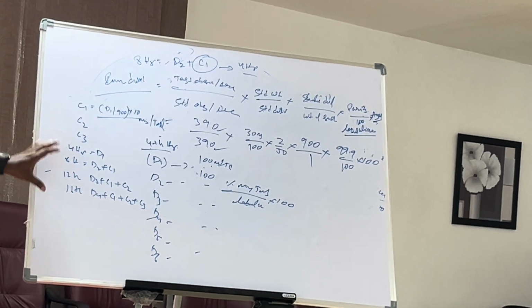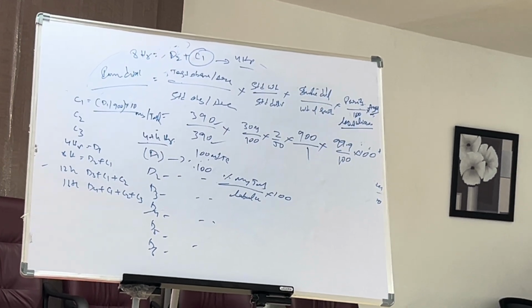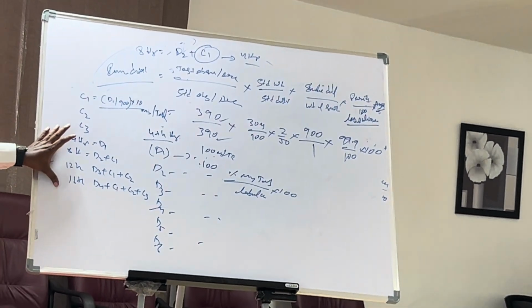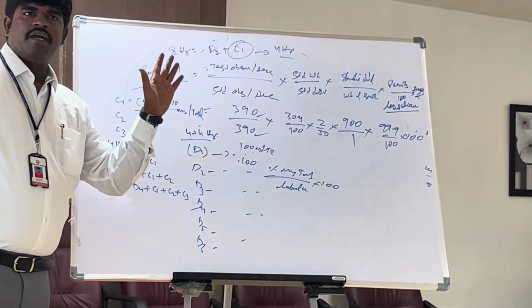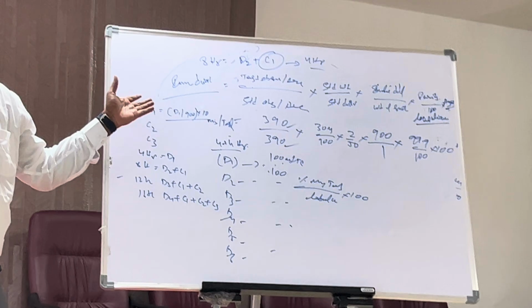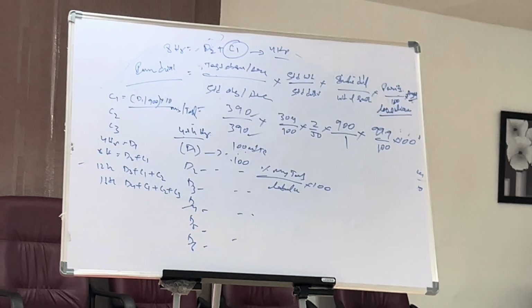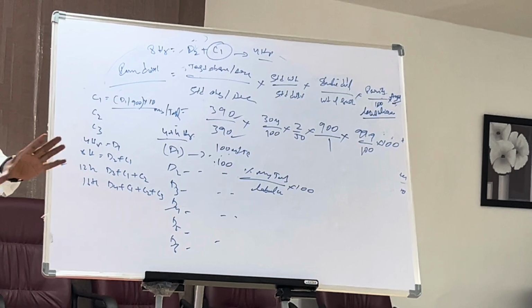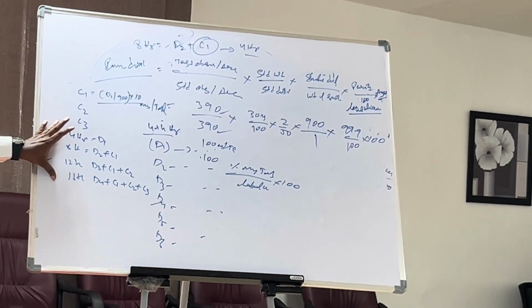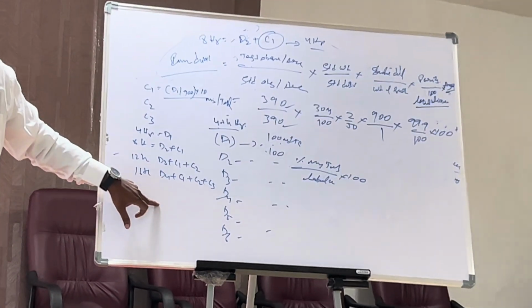If you do the dissolution profile, or even the dissolution batch release single point, this is the concept. Understood everyone? Value calculation will be the same: test absorbance divided by standard absorbance. If you observe commonly, anywhere it is the same practice. But we all thought that dissolution is different, HPLC is different, UV is different. Anywhere, the system, process and calculation will be the same. The only thing is, whatever adjustment you do in this particular technique, the same you incorporate as these correction factors. Understood?